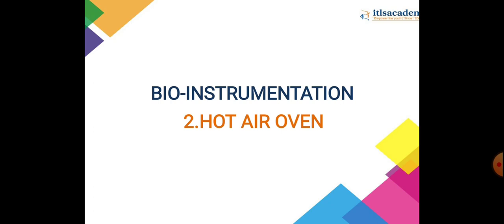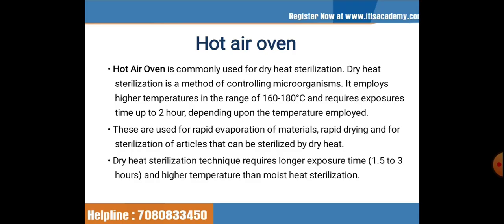In today's lecture, in continuation of that video on sterilization, I am taking the second instrument, the hot air oven, which depends upon dry heat sterilization. Okay, let's start with our lecture. Hot air oven is commonly used for dry heat sterilization.